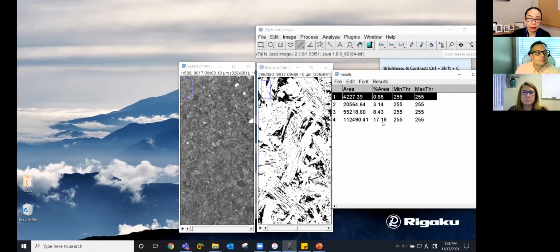Depending on the CT scanner you use, you might use different reconstruction programs. But if you purchase a regular, commercially available CT scanner, usually the CT scanner comes with a reconstruction program, because there are a lot of things you have to tune to do the reconstruction in terms of how you did the experiment. And those parameters are specific to the machine you're using.